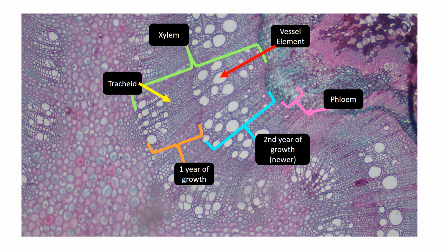And in our case, for our slides, the angiosperms have them, the gymnosperm doesn't. And that fern kind of had some big ones. So we can show that vessel elements are not necessarily a homologous, unique trait to the angiosperms only. It popped up several different times. It's a convergent evolution amongst plants. But so that's our years of growth. Hopefully it can help you recognize what you're looking at with that vascular tissue.